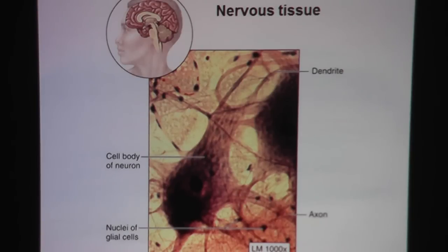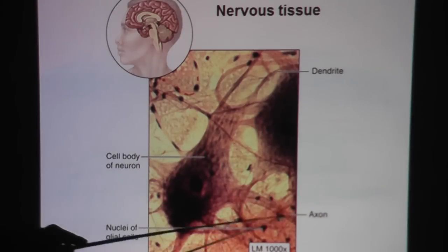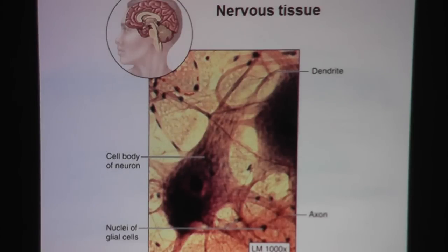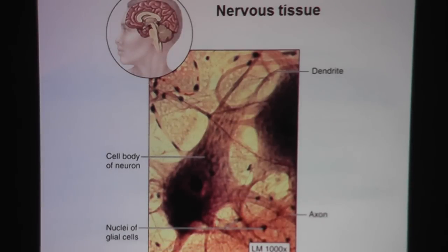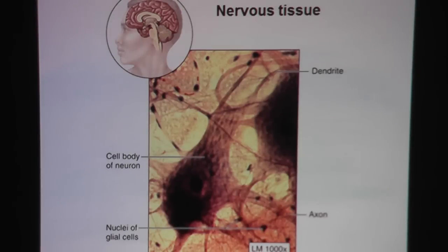Anything outside of the nucleus would be the cytoplasm of the neuron. Remember, neuron is the nerve cell. And then there are these projections coming out from the cytoplasm — those projections are called processes. Plural would be processes, singular would be just one process. Should you see a slide where you can see the entire cell, you should see one process as being the longest, and that longest process would be called the axon. All the other shorter processes would be called dendrites.